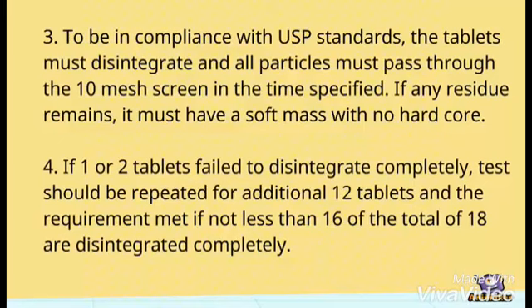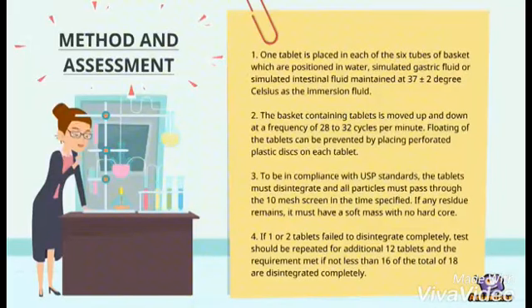If 1 or 2 tablets fail to disintegrate completely, the test should be repeated for an additional 12 tablets, and the requirement is met if not less than 16 of the total of 18 are disintegrated completely.